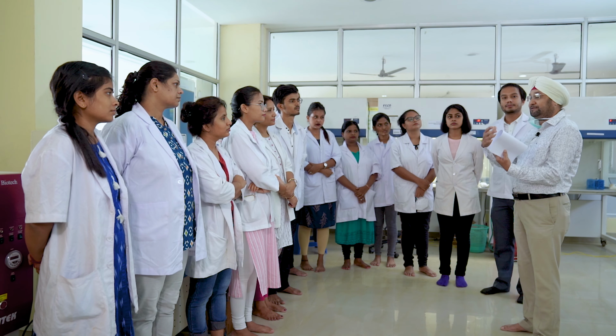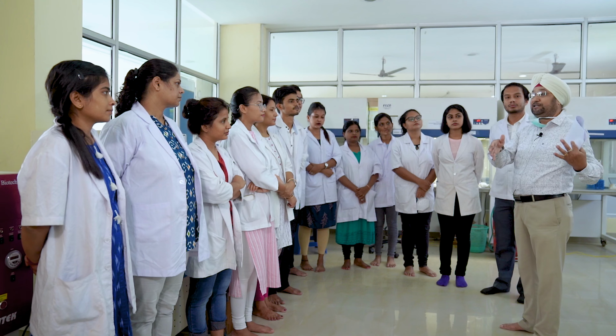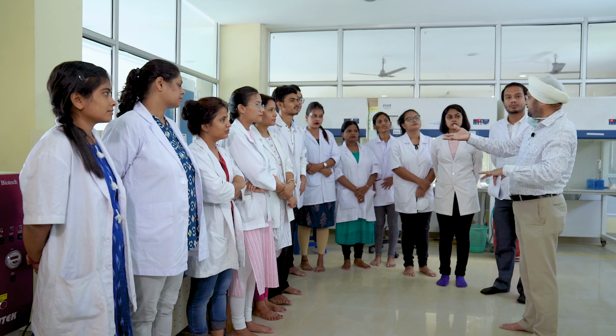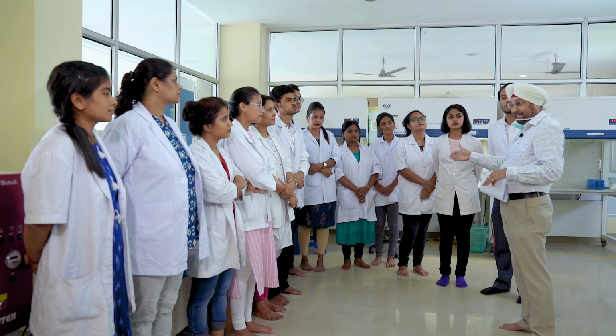Then this embryogenic cell suspension we generally infect with the Agrobacterium. Then we allow the embryogenic cell suspension to undergo maturation to develop mature somatic embryos, and those somatic embryos which mature, we then put in the selection.